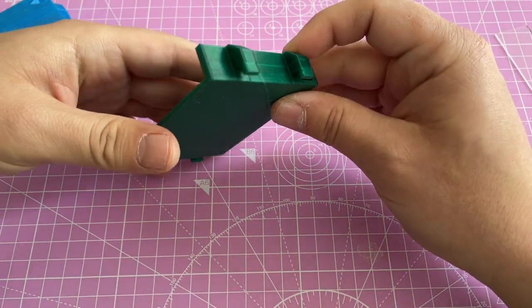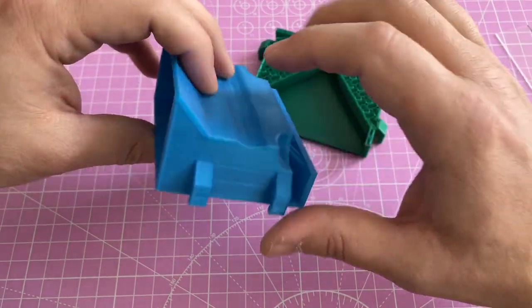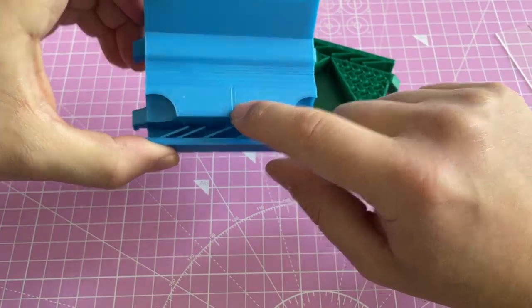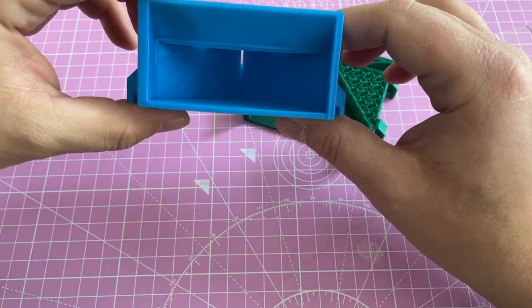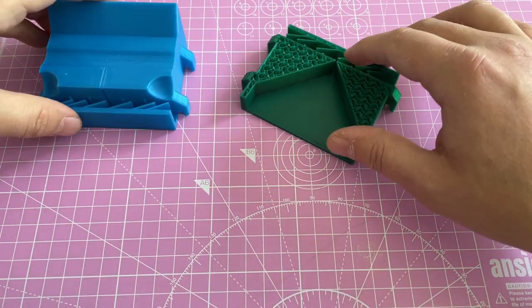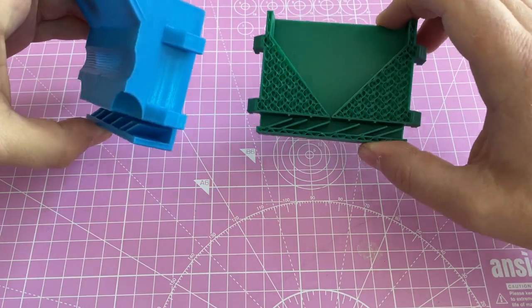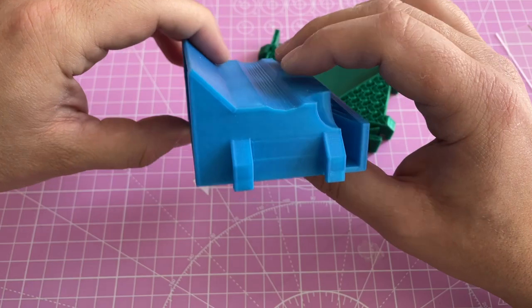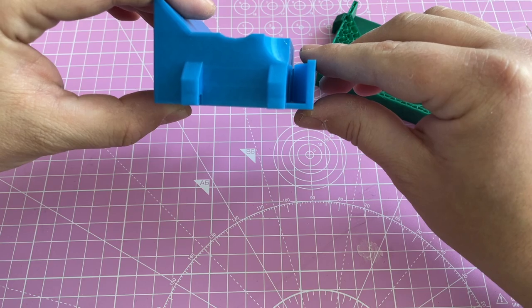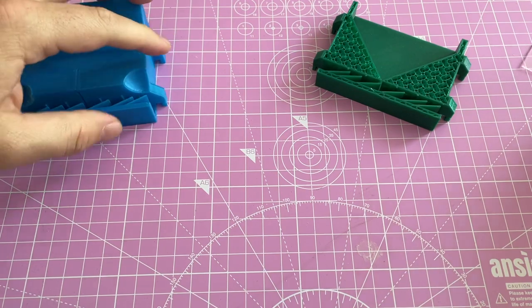Practically that's it. You have four attachment points, with which you attach some rubber bands to your handlebar. You bike around, collect particles, in most cases, I mean, now it's pollen, and they will focus here on your glass slide. Simple design, it works quite well, and for making it, you need to print it without support, because those parts are printed mid-air, so you don't need any support, otherwise it will fail. And it's printed in one single block.